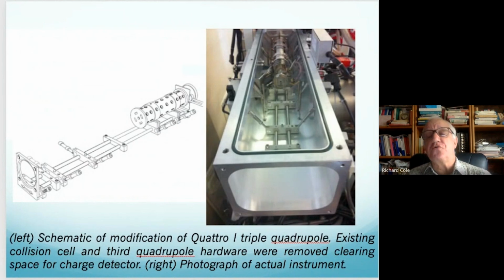The Jarrold group at Indiana and also Evan Williams at Berkeley are a couple of the leading groups in advancing charge detection mass spectrometry. And they've gotten good support to build great instruments.